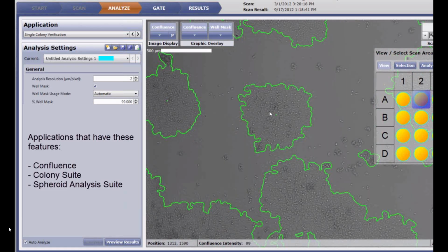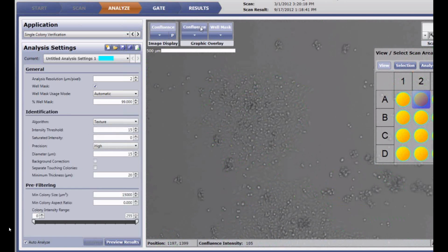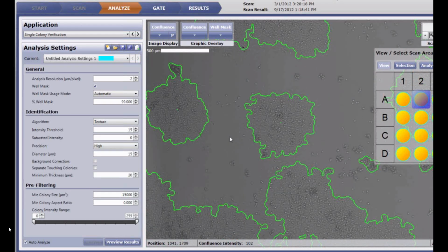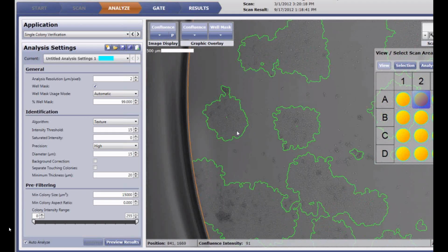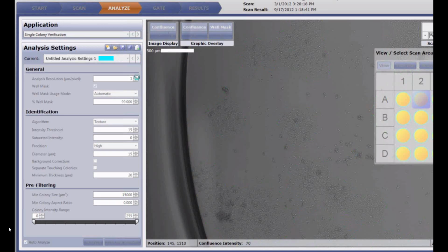It's doing a pretty good job with 2 microns, so you can see where 1 micron was not going to get you any better. If anything, the higher the value, the faster the analysis too. 1 micron would just take forever for these large well types, but as you increase that value, it becomes much, much faster. Let's take a look at this particular colony and adjust the resolution, or at least increase the value so the resolution is lower.